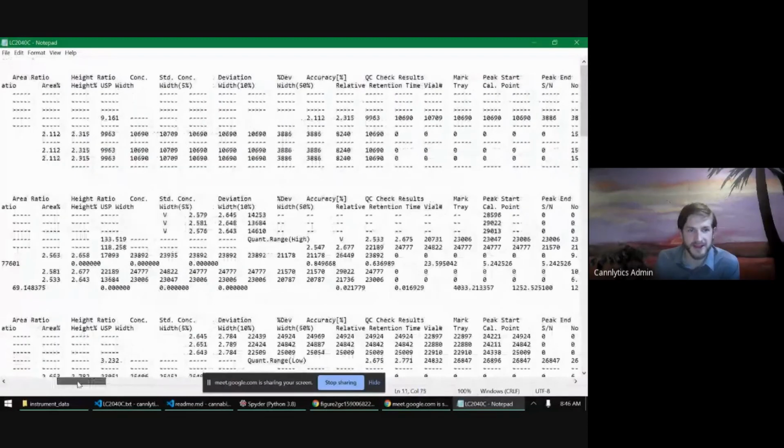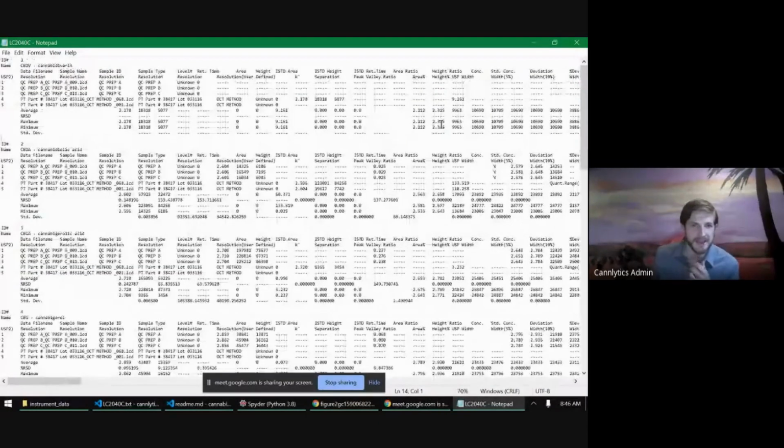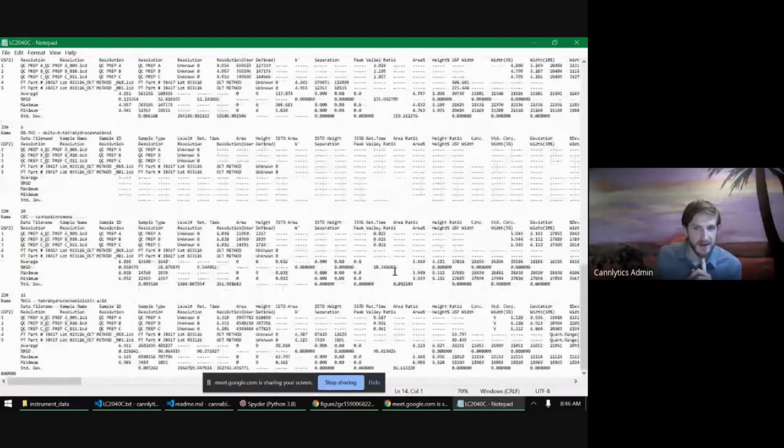So as you can imagine here, for each of these, I would be transcribing the concentration.